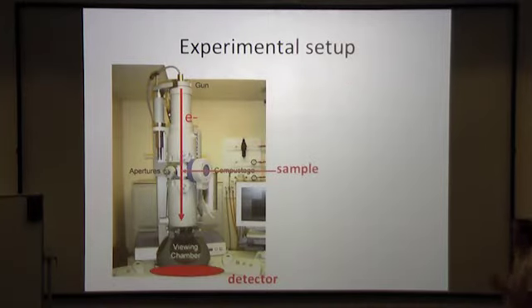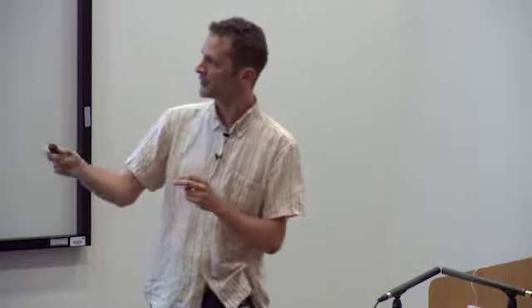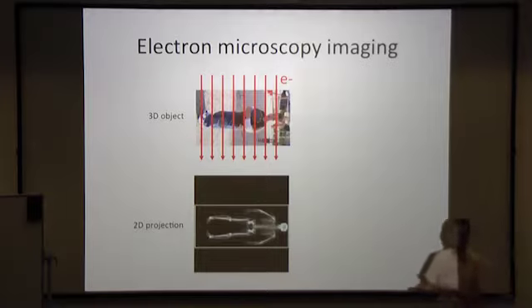Chris already discussed the microscope, and so did Christos. But basically, Laurie explained how we have a little shallow swimming pool full of Jans who swim around. There are many copies of Jan, and they swim around in all kinds of different orientations, go inside this high vacuum machine, and then we shoot electrons through them.